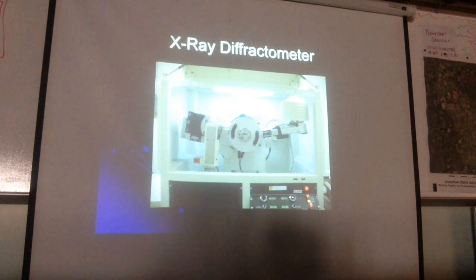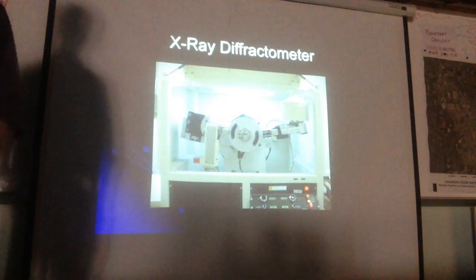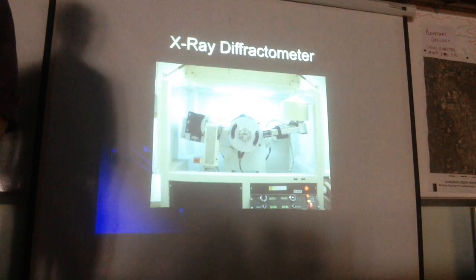Especially when you're dealing with multiple polymorphs of the same mineral and there's not a lot of documentation on what causes those polymorphs to form, and you detect it in your scan, you're like, okay, well, what caused this? And why is this here?